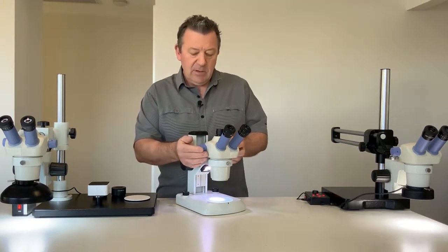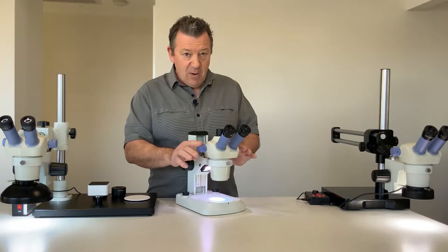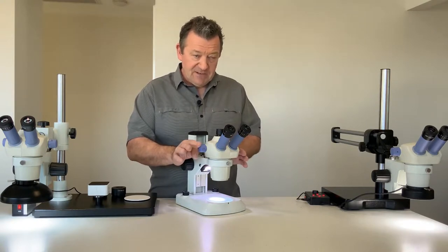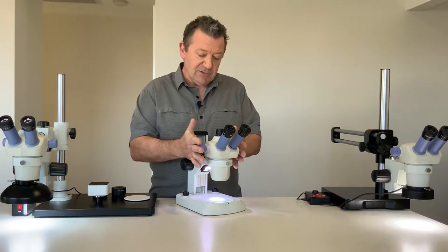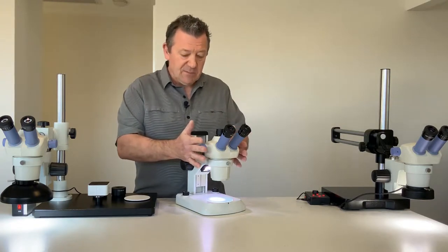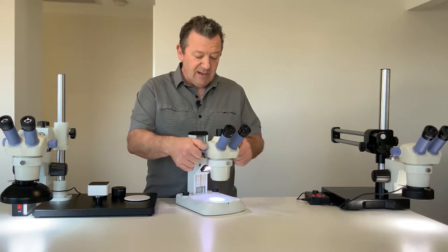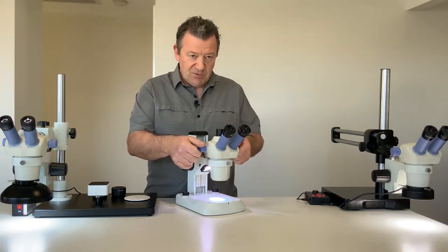Then we have the all-important optical head. The difference between a stereo microscope and a stereo zoom microscope is that on a stereo microscope you have fixed magnifications of generally 20 times and 40 times. With the stereo zoom microscope such as the ASZ400, we have a continuous zooming range from 10 times all the way to 45 times.